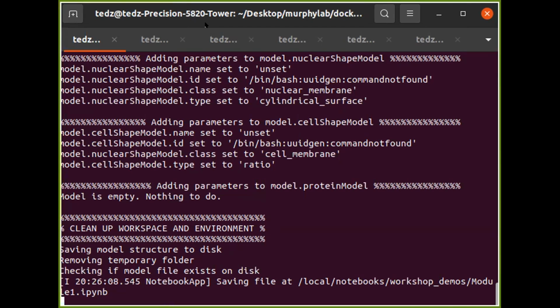Oh, so it gives me a local address with a number. So basically, that's where I'm working, and that's my working environment now. That's what it is. Did you pull? There should be a link in a notebook in there to pull all the other notebooks. Did you pull that already?